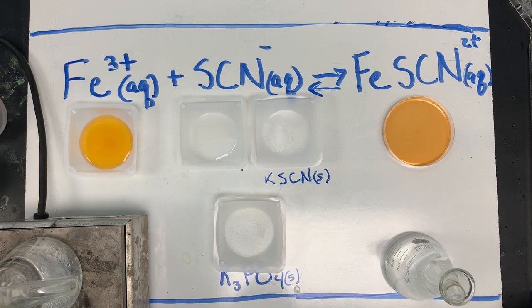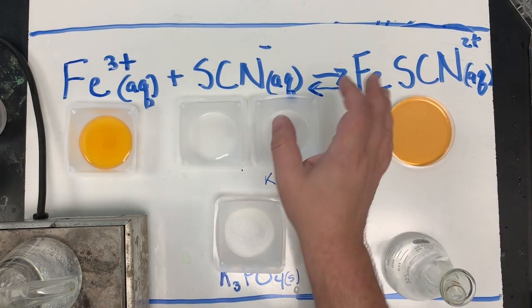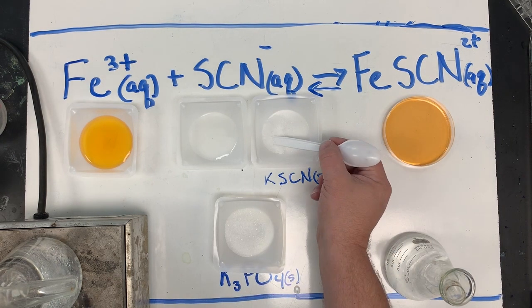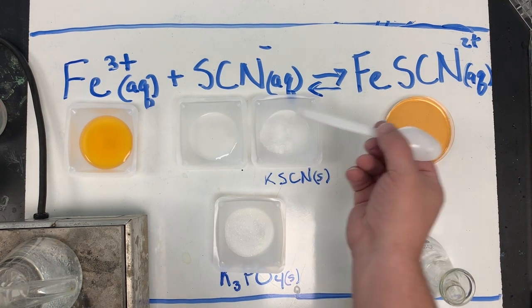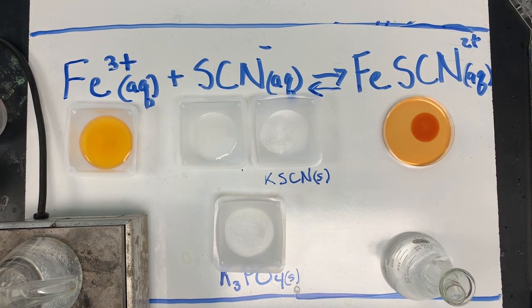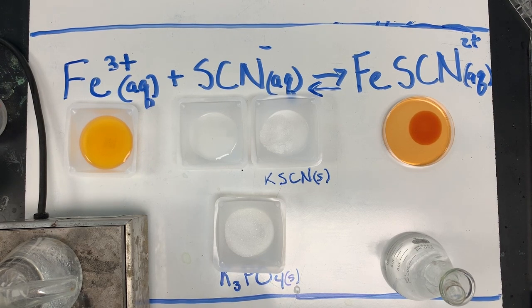If I want to make more of one or make less, we can use chemicals involved in that equilibrium to drive the reaction forward or backward. So what I'm going to do first is I'm just going to add some thiocyanate crystals, and I'm going to put it right here and you can see what's happening with the color change you observed. What does that mean with regards to shifting the reaction back and forth? Which direction did we drive the reaction?